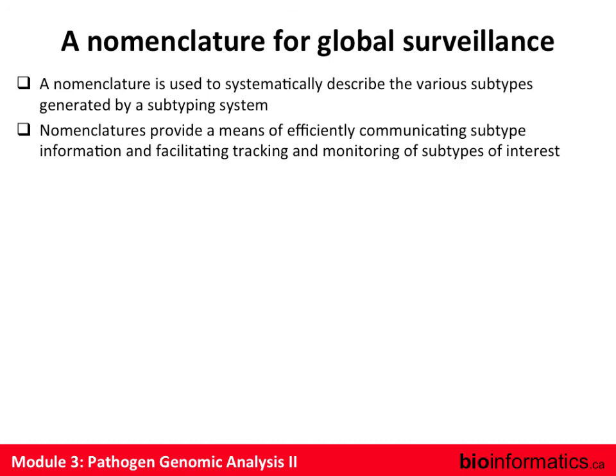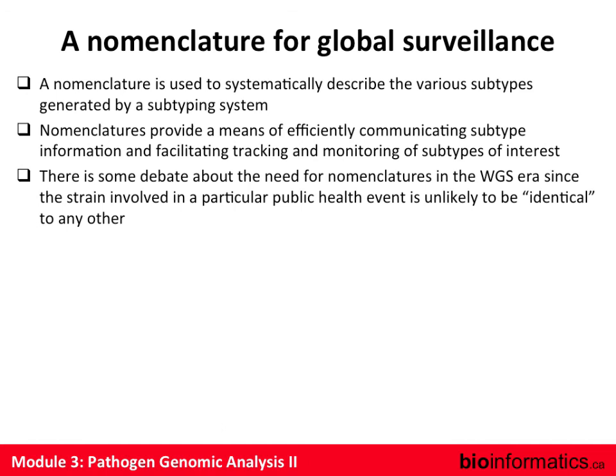One of the things, when Gary was talking about SNVs and the ephemeral nature of SNVs, to extend it to the logical conclusion of that thought process, there are a lot of folks that say, look, every outbreak is going to be unique. There are no two outbreaks that are going to be the same, not with whole genome sequencing. Why do we need to give it a name? It's a very valid argument.